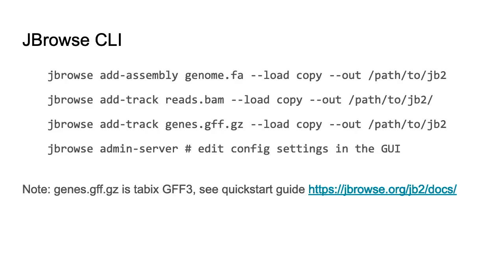And for the admins and model organism database people, we made a CLI tool that helps you load your tracks and your genome assemblies. And we're going to be going over that in that tutorial session following me and following Caroline. But we just try to make it easy to get these tracks loaded.